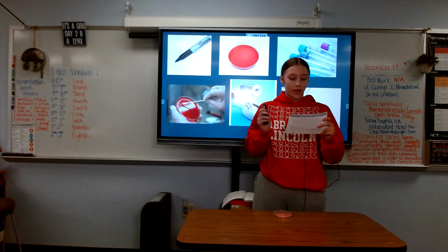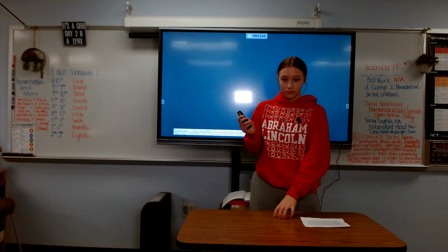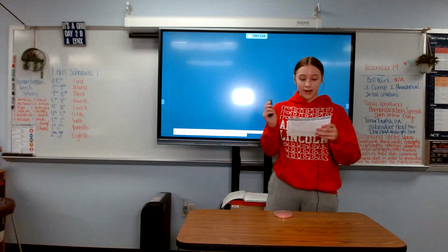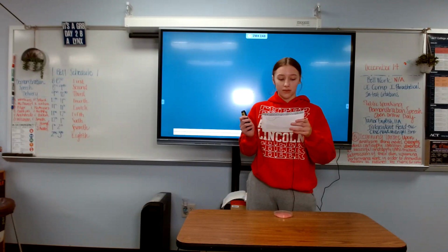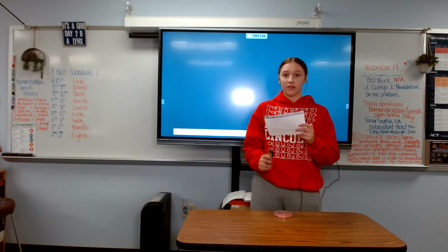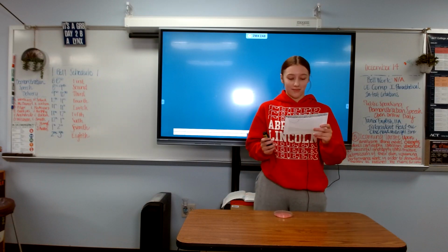First, you will label your specimen, your agar plate. You will label it with the time and date of setup, patient's name, patient's medical record number, specimen source, and the first initial and full last name of the person setting up this plate. Next, you're ready to start streaking.